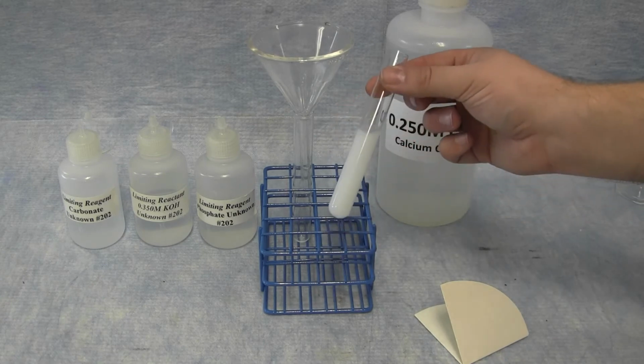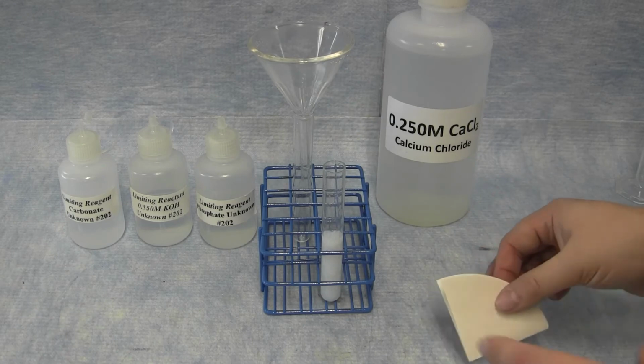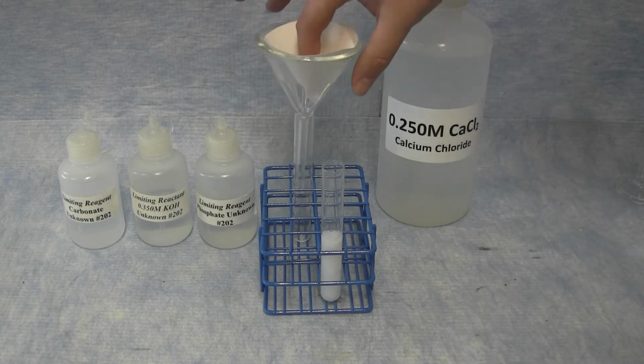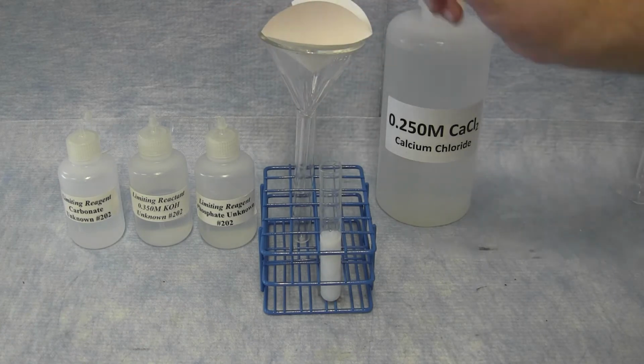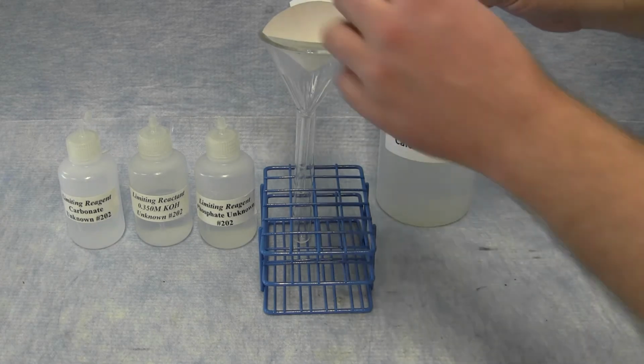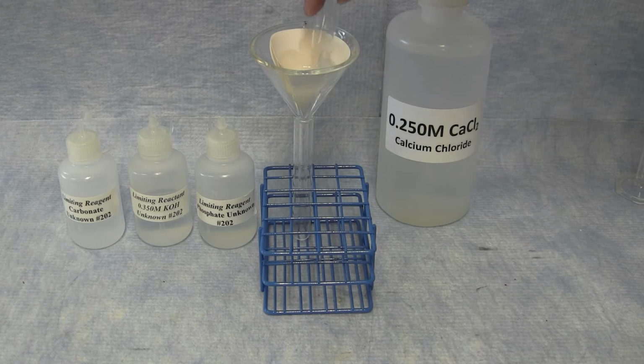This combination of precipitate and the remaining liquid can be filtered using a piece of filter paper and a funnel. It can be placed directly in a second test tube, and the solution can be poured into the filter paper.